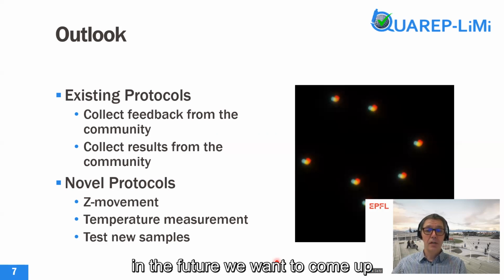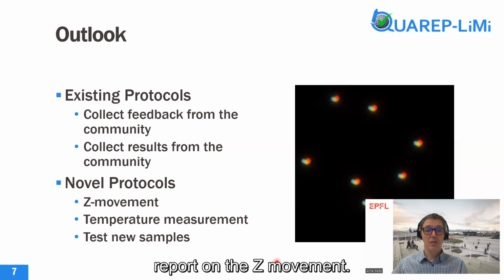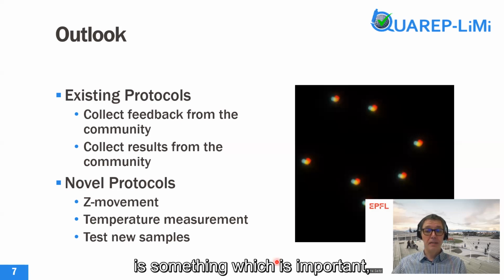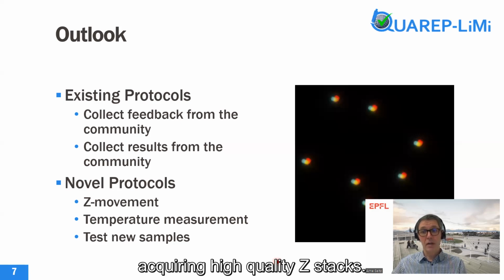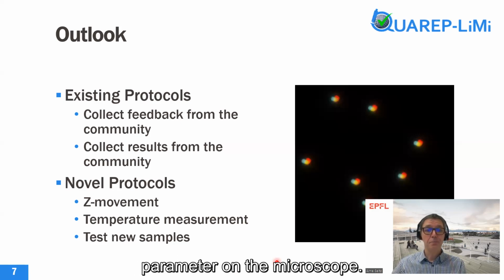In the future, we want to come up with a protocol which can also report on the Z movement, the Z readability and reproducibility. It's something which is important, for example, when acquiring high quality Z stacks. And we want to come up with a protocol which can report also on that parameter on the microscope.